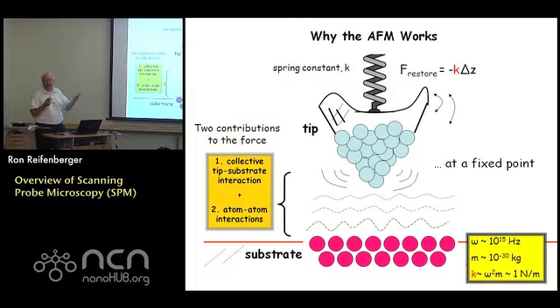Well, if the forces are attractive, let's say, the tip is going to be attracted toward the substrate. And if you suspend the tip, let's say on a spring, this is a hypothetical model, right? If you suspend the tip on the spring, and there's a downward force on the tip, the spring will stretch until a restoring force is developed in the spring that just counteracts the attractive force between the tip and the substrate. So the spring will stretch through a distance delta z.